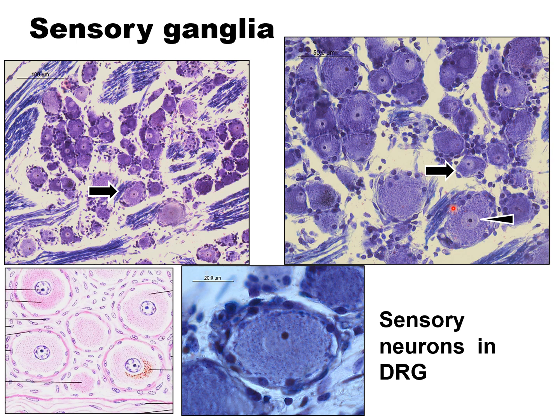The nerve fibers or the axons come out, and they lie in between the neurons. So here the nerve fibers are present. Notice that groups of neurons are there, and they are separated by nerve fibers.